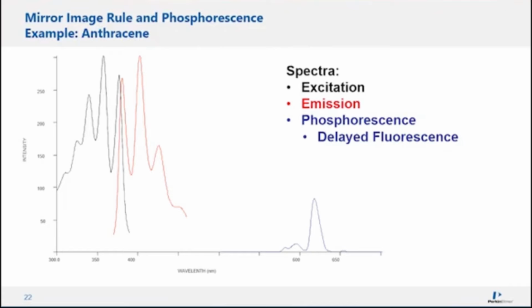Another thing displayed on this particular spectrum is phosphorescence, which occurs when the sample undergoes a more complex electronic transformation. Fluorescence detection focuses on fluorescence and not phosphorescence most commonly. The easiest way to differentiate the two is by how long the emission occurs after the excitation. Fluorescence will cease very shortly after the excitation ends, whereas phosphorescence can last for many seconds afterwards. Those glow stars you may have had as a kid on your bedroom ceiling are a good example of phosphorescence.